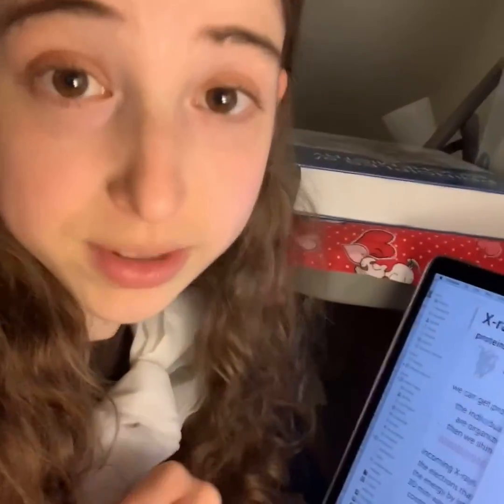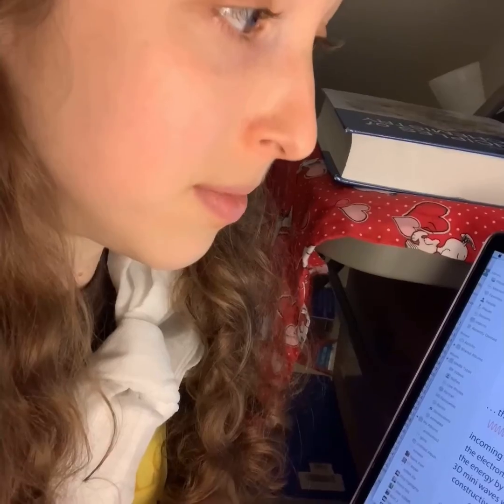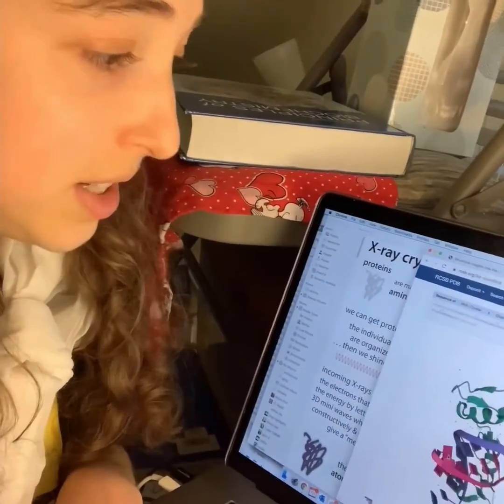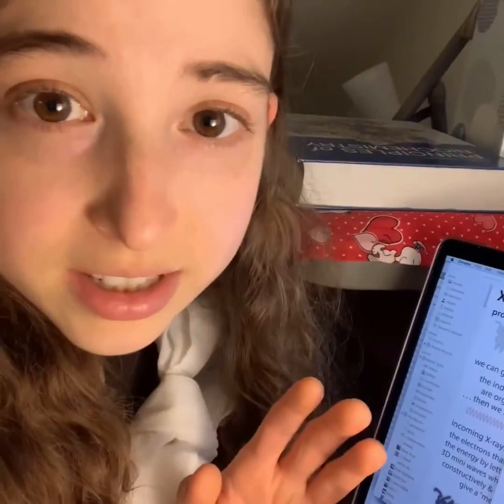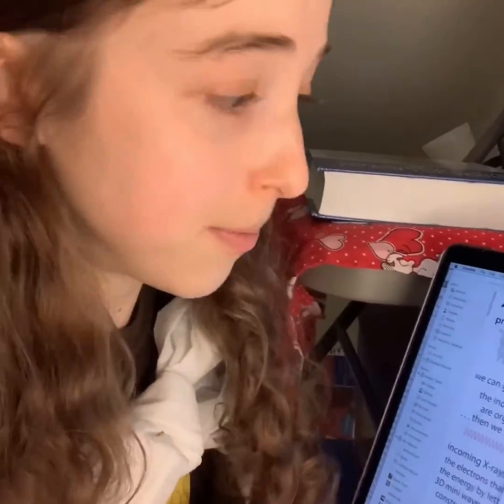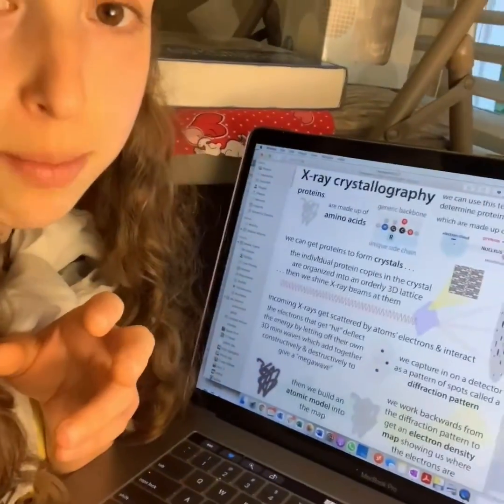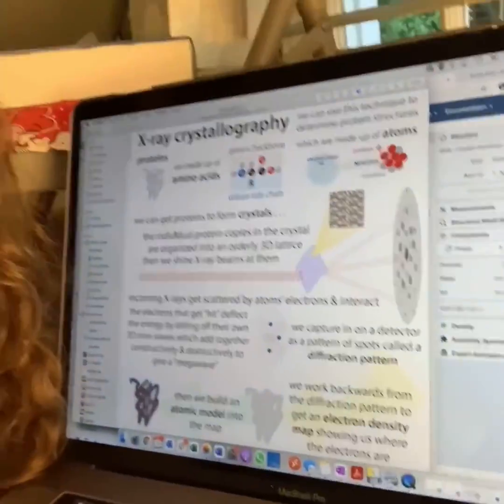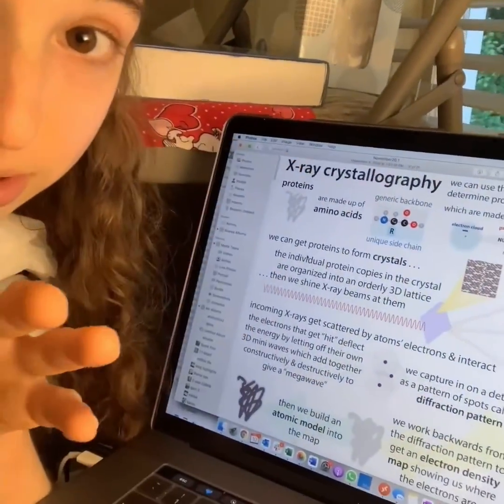The PDB is the Protein Data Bank, and it allows you to see and play with, in 3D, different structures of proteins and protein-DNA complexes like this, as well as DNA and RNA and all sorts of cool stuff. Many of these structures are solved using a method called X-ray crystallography. More about this later, but the basic idea is that you get your protein or your complex to freeze in place in the same position throughout the crystal, in what we call a lattice.